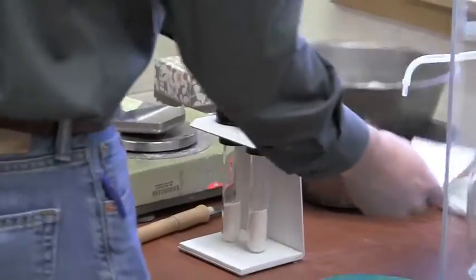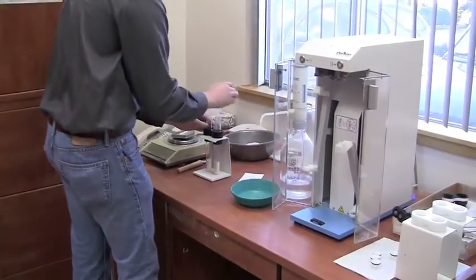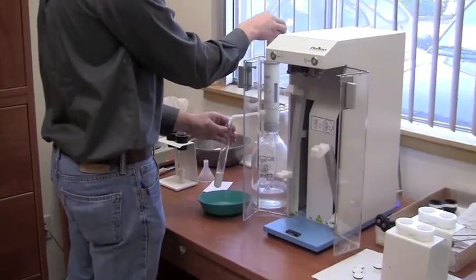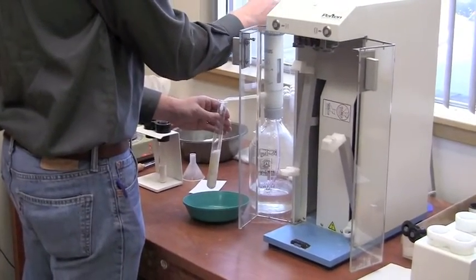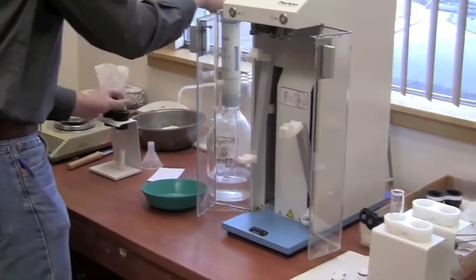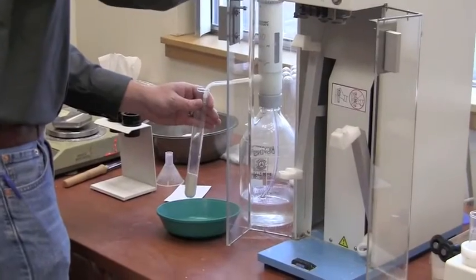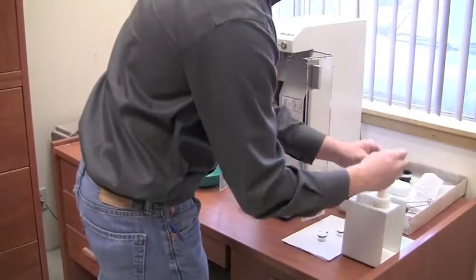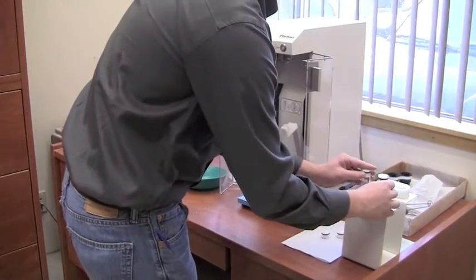Now he's going to introduce 25 milliliters of distilled water into each test tube. This is an apparatus that's calibrated at the beginning of each day to make sure that it's exactly 25 milliliters of water.